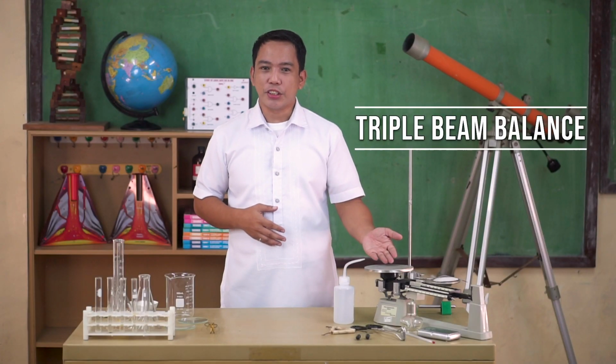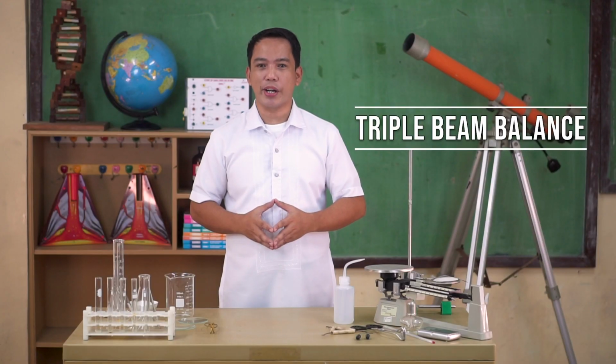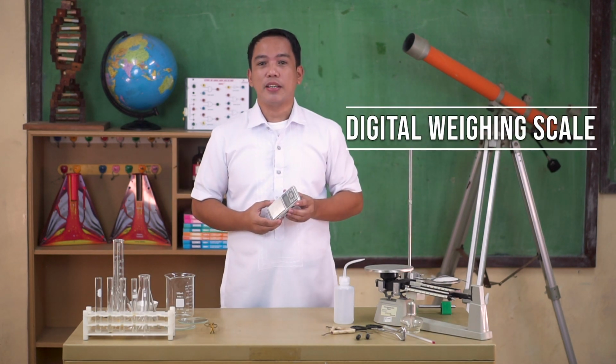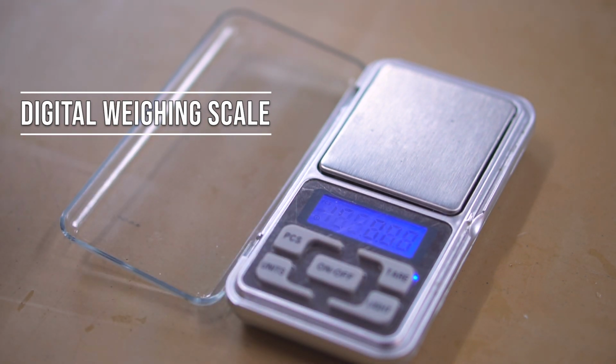Triple beam balance is used to measure mass very precisely with a reading error of plus or minus 0.05 grams. Digital weighing scale is a measuring device that reads and displays weight of an object accurately.